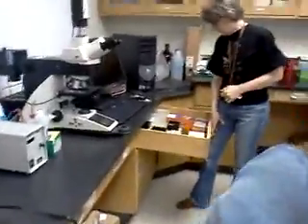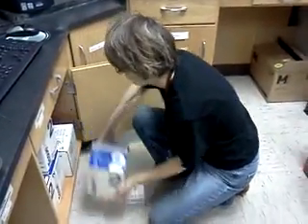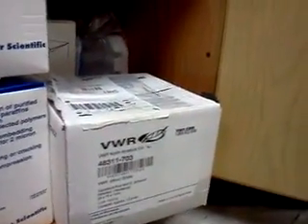And then slides are in here. And if he's going to be doing this, he might want to order his own box of slides. I think he should do that. So this is how they come. Here's the product number, and this is the box. So you can do that. But until you get them, you can use some of ours.